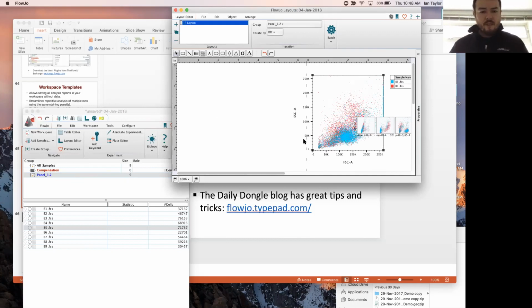We also have another question coming in, the minimum number of cells required for a statistically significant experiment. I think bare minimum is maybe 100 events, assuming you've done good quality control and you're sure about the nature of those events. But obviously, the more data points you have, the better. And in some cases, for rare cell analysis, we've seen people use many fewer than 100 cells.